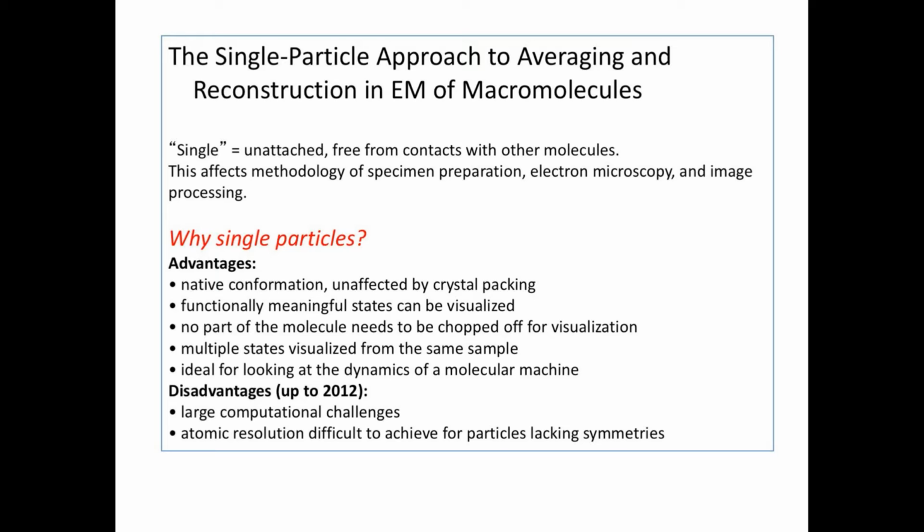So we don't have any minimization here. We really observe the molecules freely in whatever they're doing. So functionally meaningful states can be visualized, and no part of the molecules needs to be chopped off for visualization, which often is the case for X-ray crystallography.